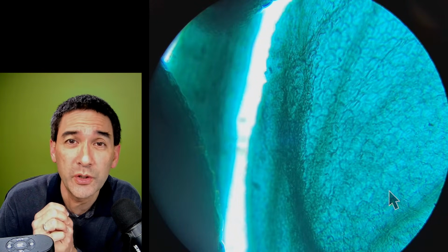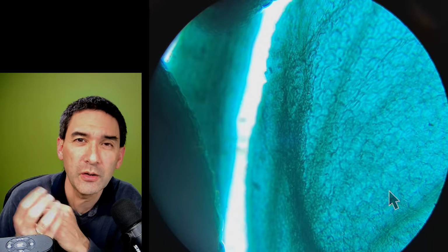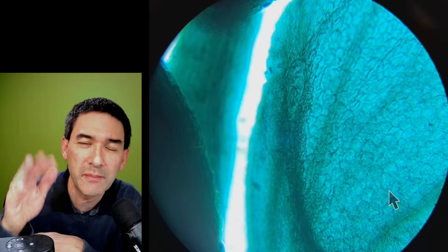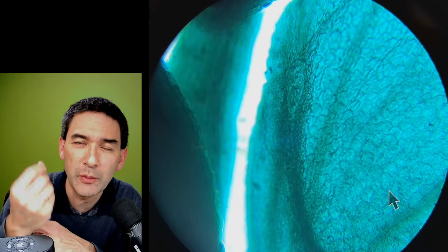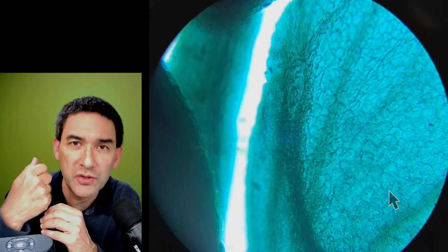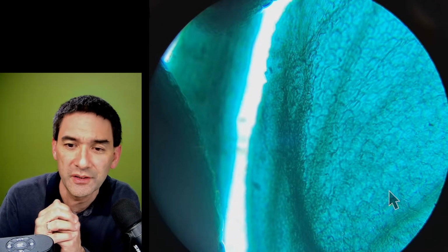What I read somewhere is that you should not use those because they contain some kind of substance that might deposit on the optical surfaces, because it's this liquid in there. But if it's pure CO2, then it completely evaporates, and there's nothing that can deposit.